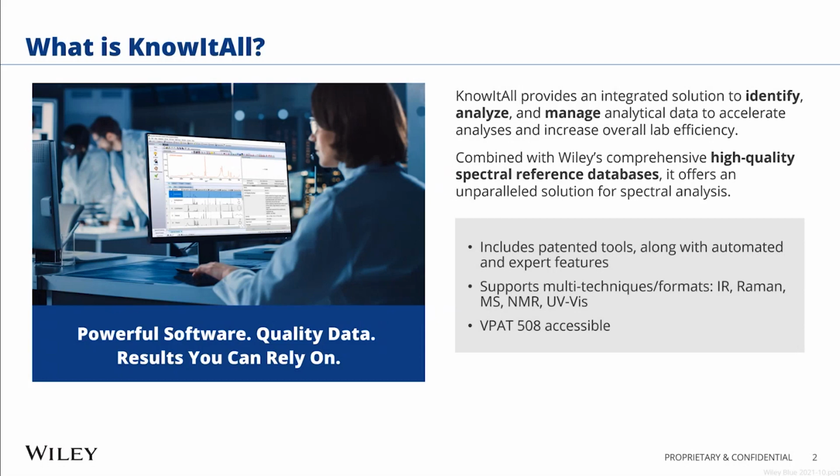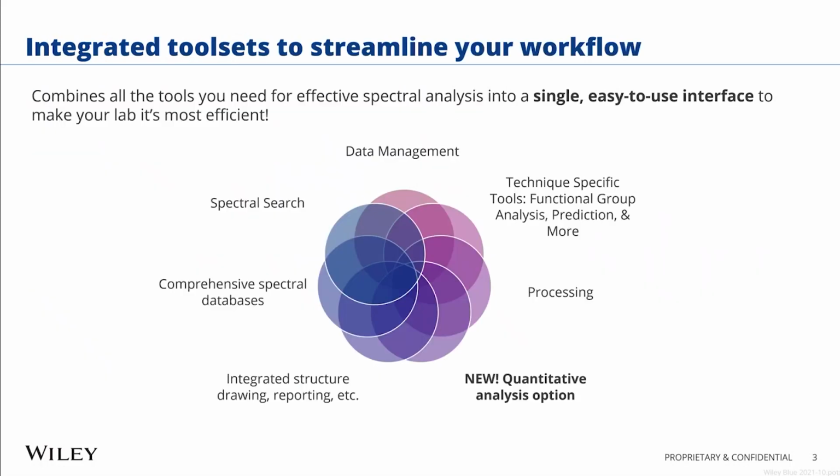It supports multiple techniques and formats, including IR, Raman, mass spec, NMR, and UV-Vis, and the software is also VPAT 508 accessible. With all the tools that you need for effective spectral analysis in a single easy-to-use interface, KnowItAll will save you time, improve your workflow, and increase your ability to reach conclusions from your data. KnowItAll integrates qualitative and quantitative tools that can fit into your current protocols.